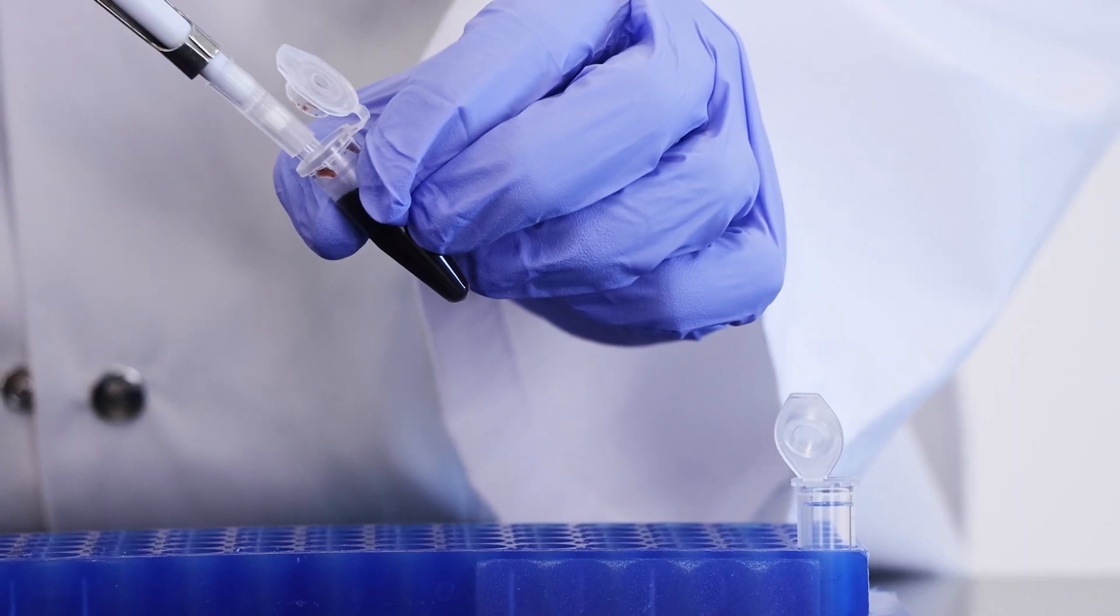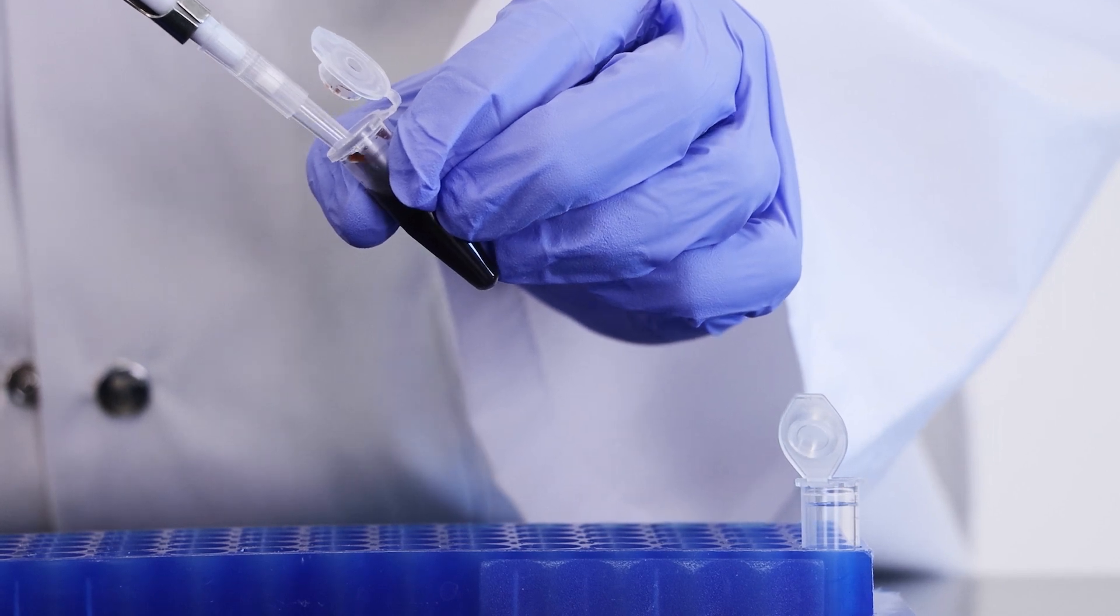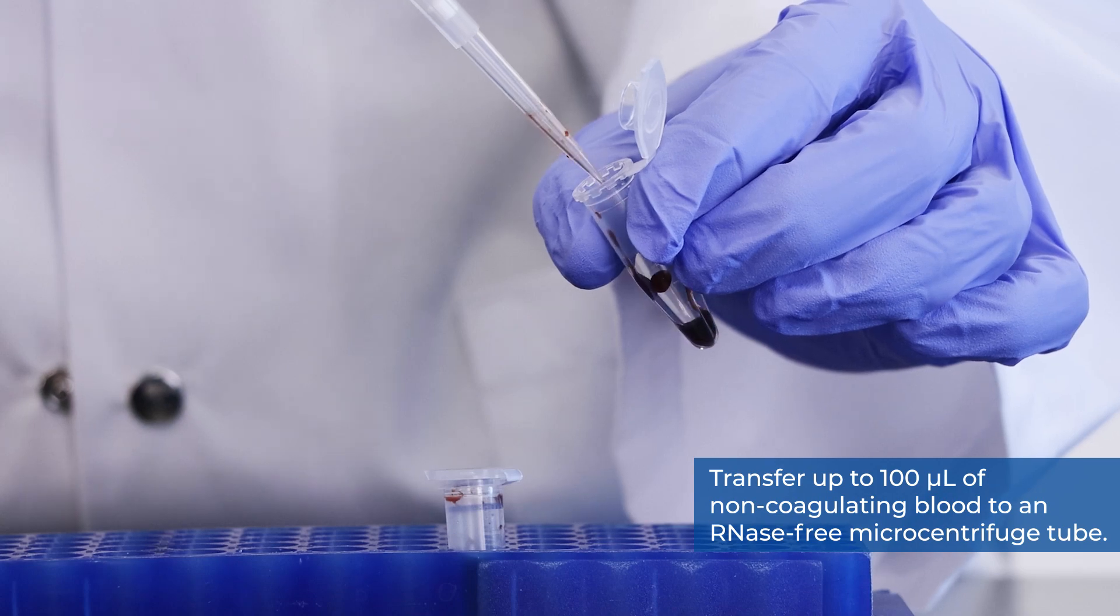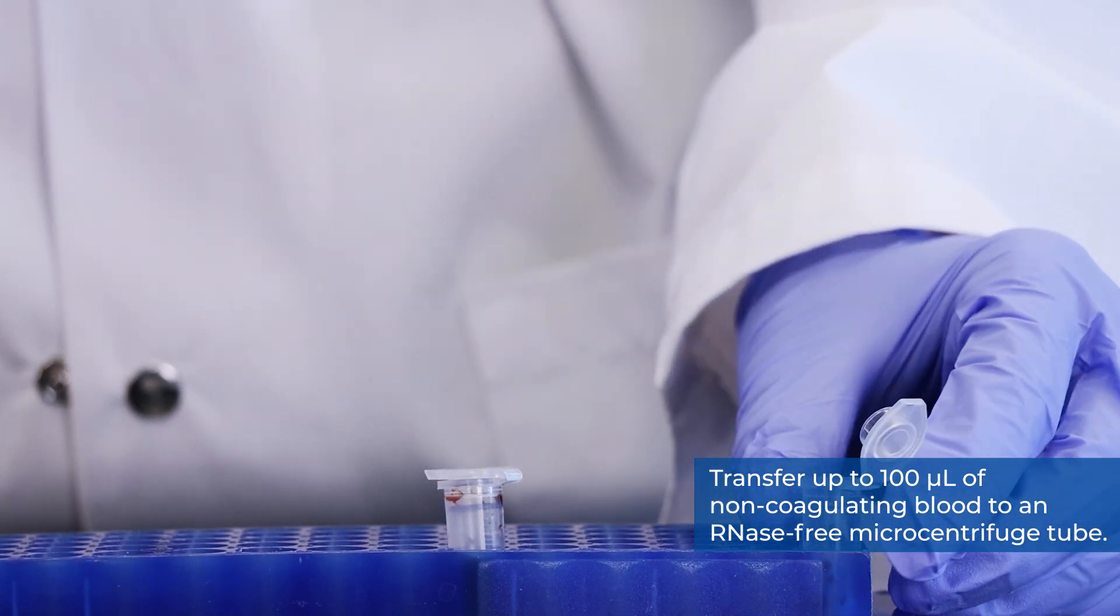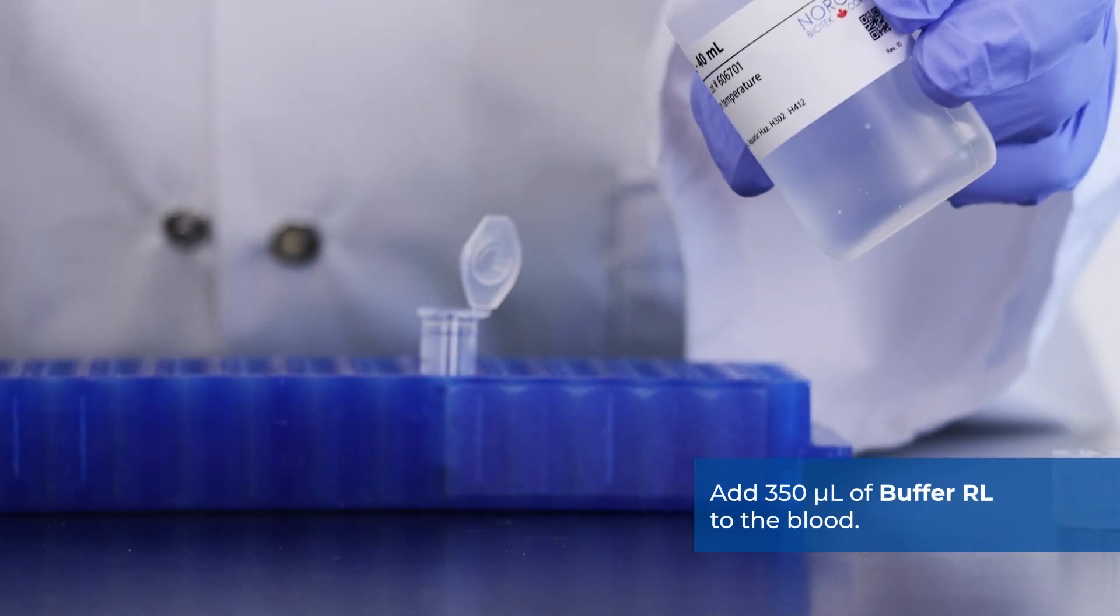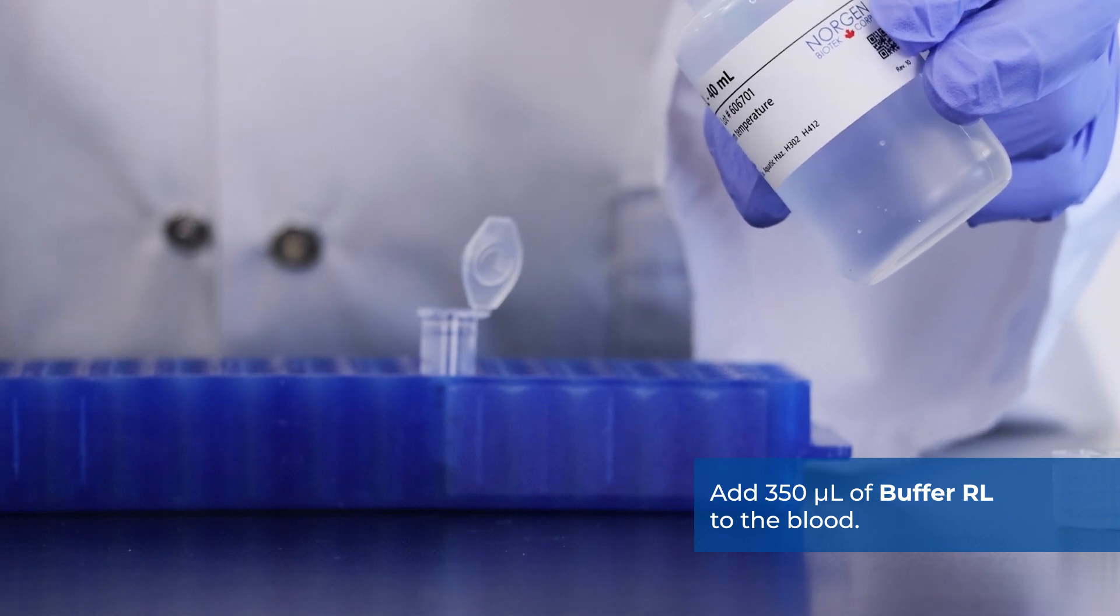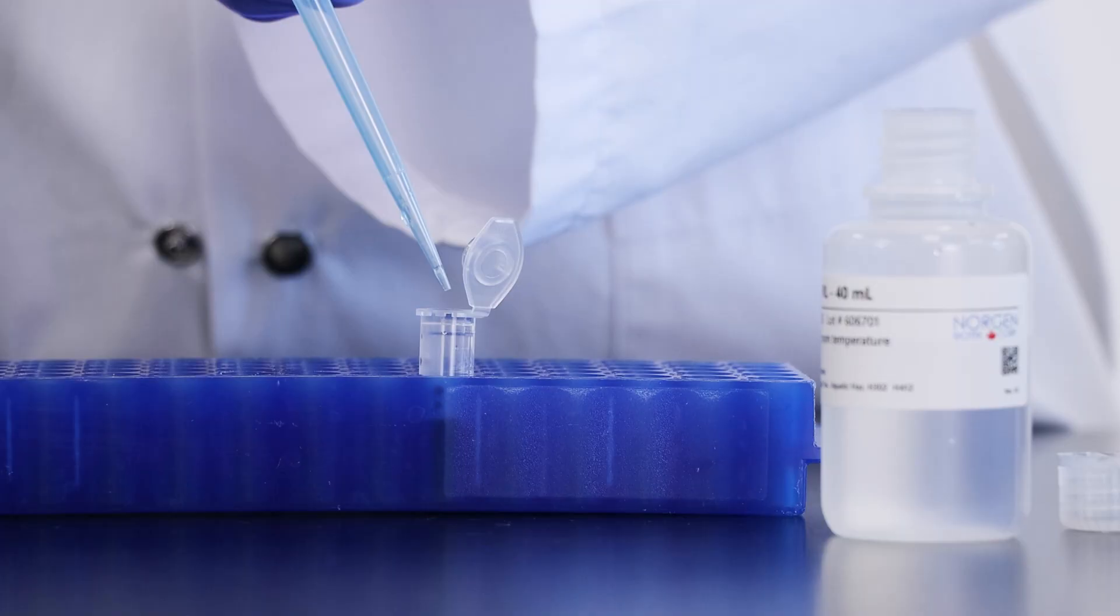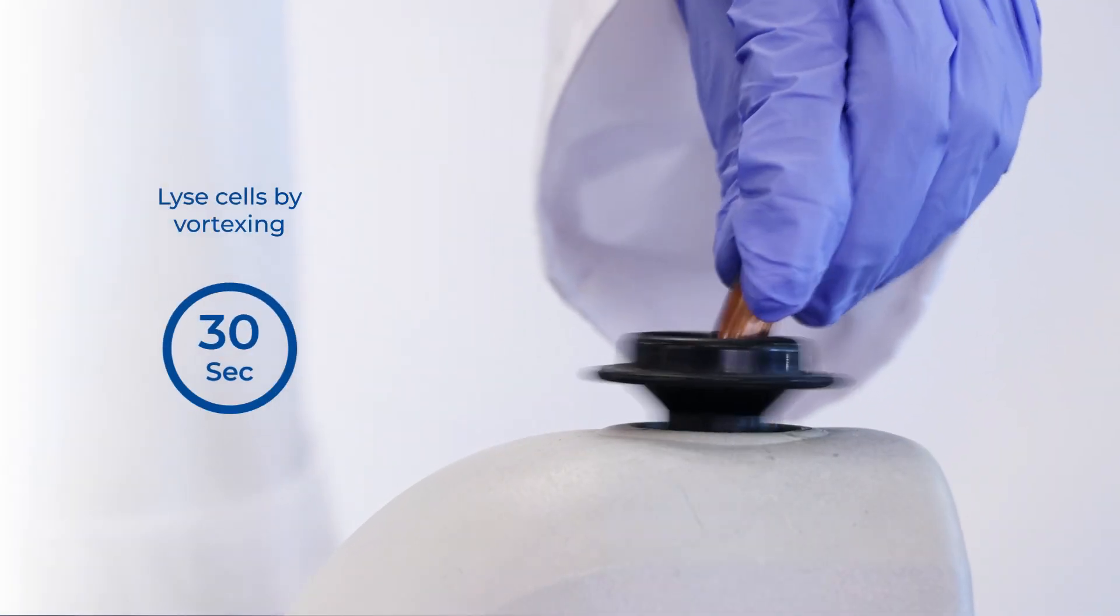Thirdly, we will demonstrate cell lysate preparation from blood. Transfer up to 100 microliters of non-coagulated blood into an RNase-free microcentrifuge tube. Add 350 microliters of buffer RL to the blood. Lyse cells by vortexing for 30 seconds.